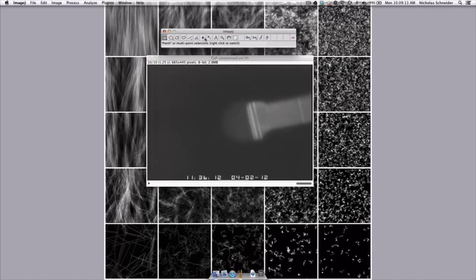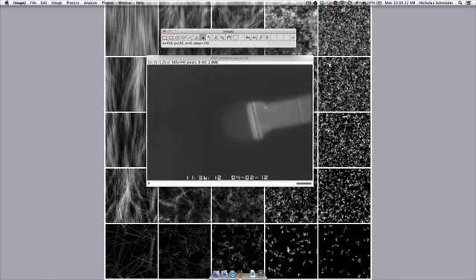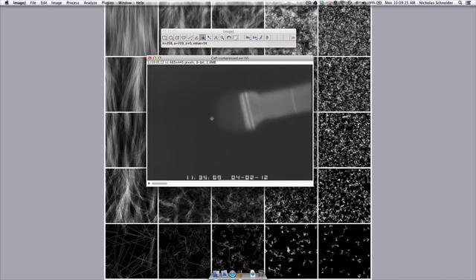So we need to click on our point tool, which is about a third of the way over on the ImageJ GUI, and this will allow us to select points in the image. We want to be on the first slice, and we can click on a point, so I'm going to follow this corner of the nanowire as it grows.